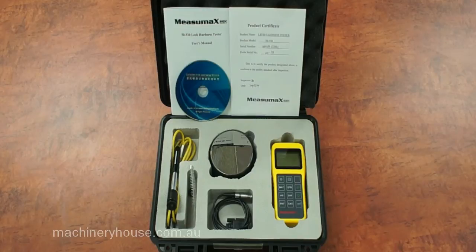Certain workpiece parameters must be met for the Lieb system to work properly. Mass of the workpiece is critical. Using the included test piece will give you accurate results every time.